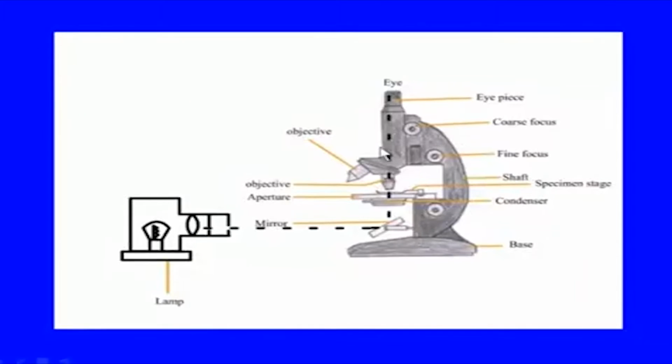Now, there is a coarse focus and a fine focus, and with these you can adjust the microscope accordingly for focusing onto the specimen. Now, let us move on to the two optical systems. In the fixed tube length, remember, the fixed tube length is around 160 millimeter, as widely accepted.